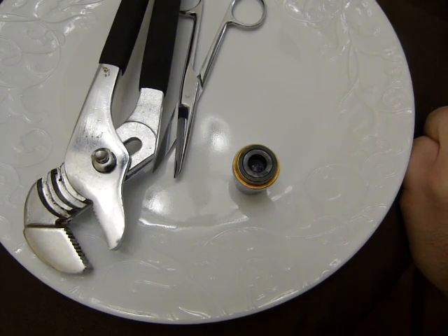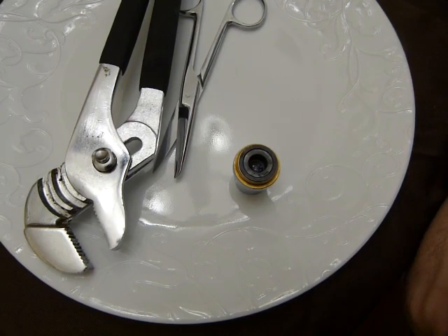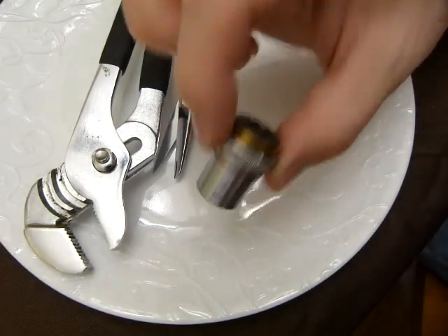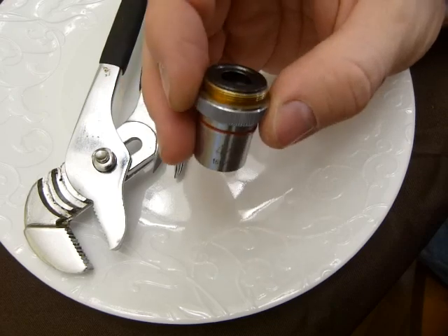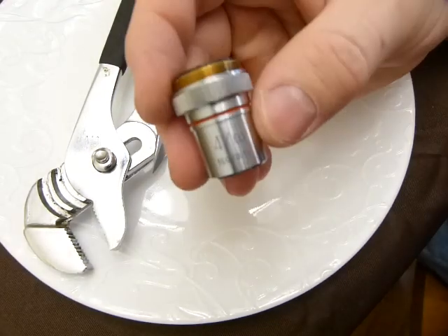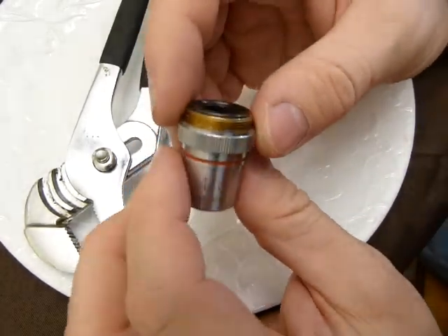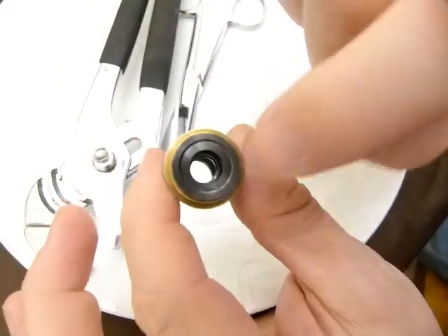Microscope lenses do get dirty, and in this video I'll show you how to take one apart. This is not the eyepiece — the eyepiece has a lens as well. This is an objective lens, actually mounted in a metal barrel. I'll show you how this one comes apart so you can clean the lens inside it.